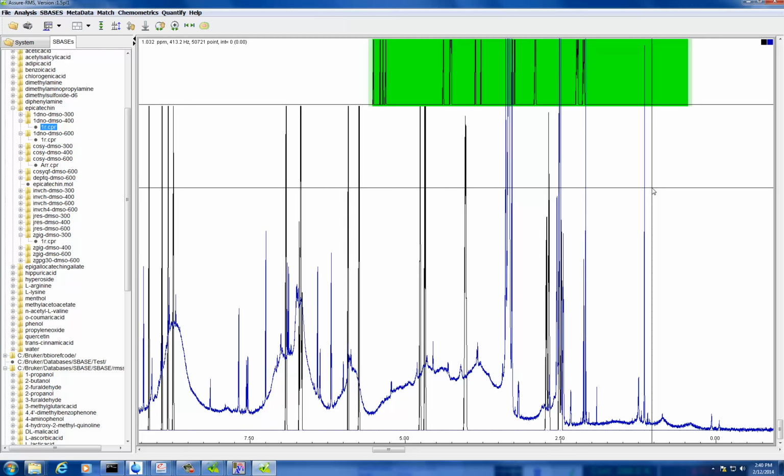Is it common for you to filter samples before you put them on NMR? Well, the extracts have to be filtered, right? Yeah, I usually spin it at extremely high speeds, and that usually helps out. Filtering is fine, but when I did biological stuff, leaves won't completely dissolve either. Sometimes I find that the filter leaks a bit, and I see some of it in the aliphatic region. So it depends on your filter as well. Once I saw that with one of my samples, I just stopped and spun it at high speeds, and that was fine with me.